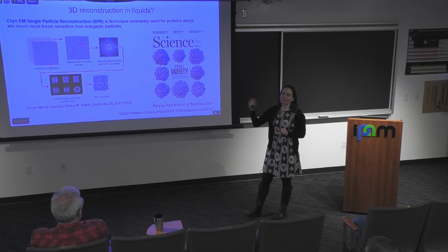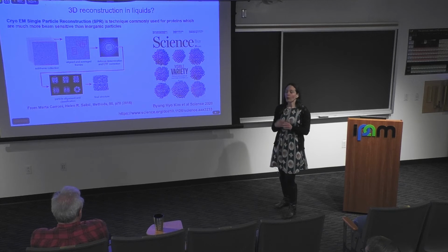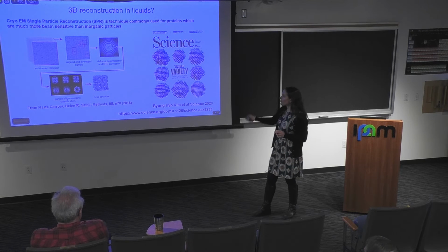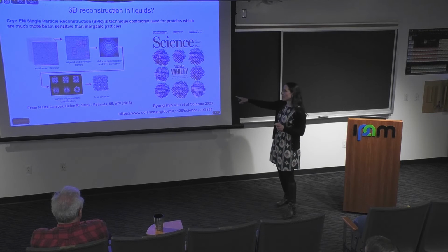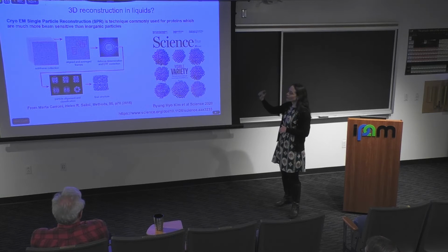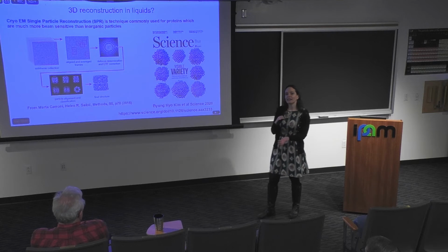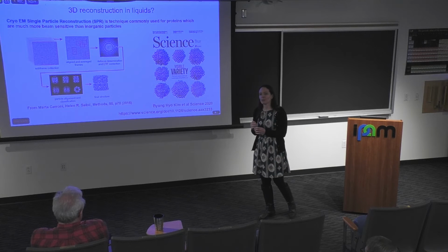In physical sciences, single particle reconstruction isn't very widely applied. And I think, in fact, one of the few approaches where it has been really successfully done is by the Berkeley group, who have looked at these graphene liquid cells again. And in the graphene liquid cells, they've had the same platinum particles that you saw back from 2010.